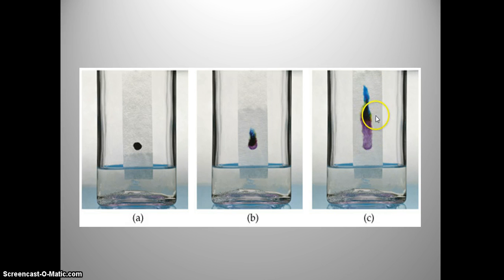We'll measure RF values for every color we can see. In this example, I can see purple, black, yellow, and blue. There might be a red chemical in the center, but it's difficult to see. I can definitely see 4 distinct chemicals to measure.